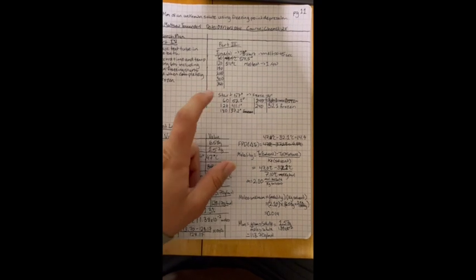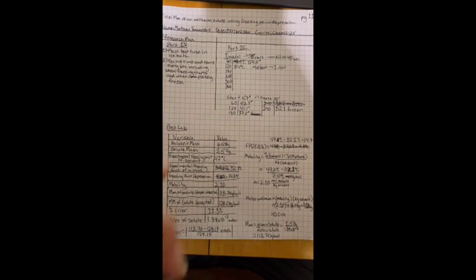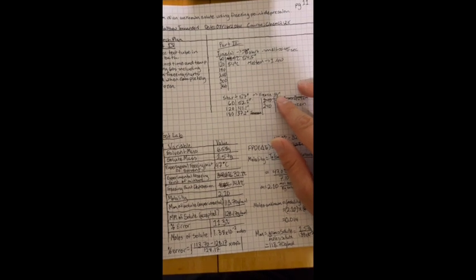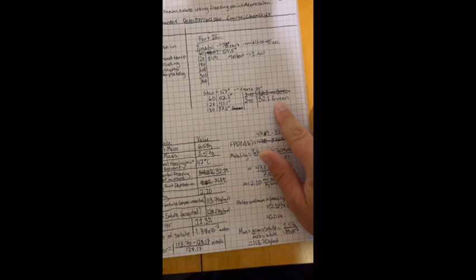This is part 4 where we were freezing it again. It only started freezing right around, I said 54 here, but I don't think that was correct. I think it was closer to 48. And then when it was frozen at 240 seconds.